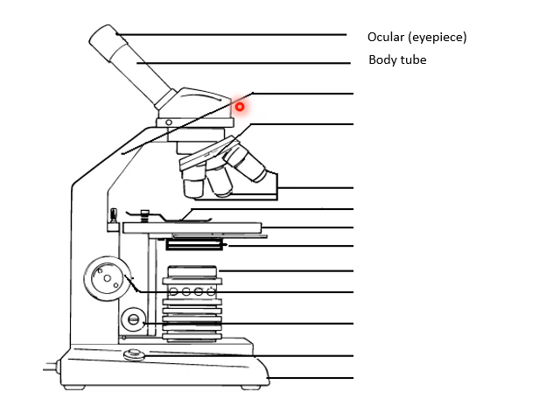The next thing on here is the arm. So this is the arm. Now, this is one type of microscope. There's a lot of different types of microscopes that are designed a little bit differently, but they basically have the same parts. So this is the arm, and basically the arm just supports the whole mechanism up here which we're going to use in order to view the specimen.